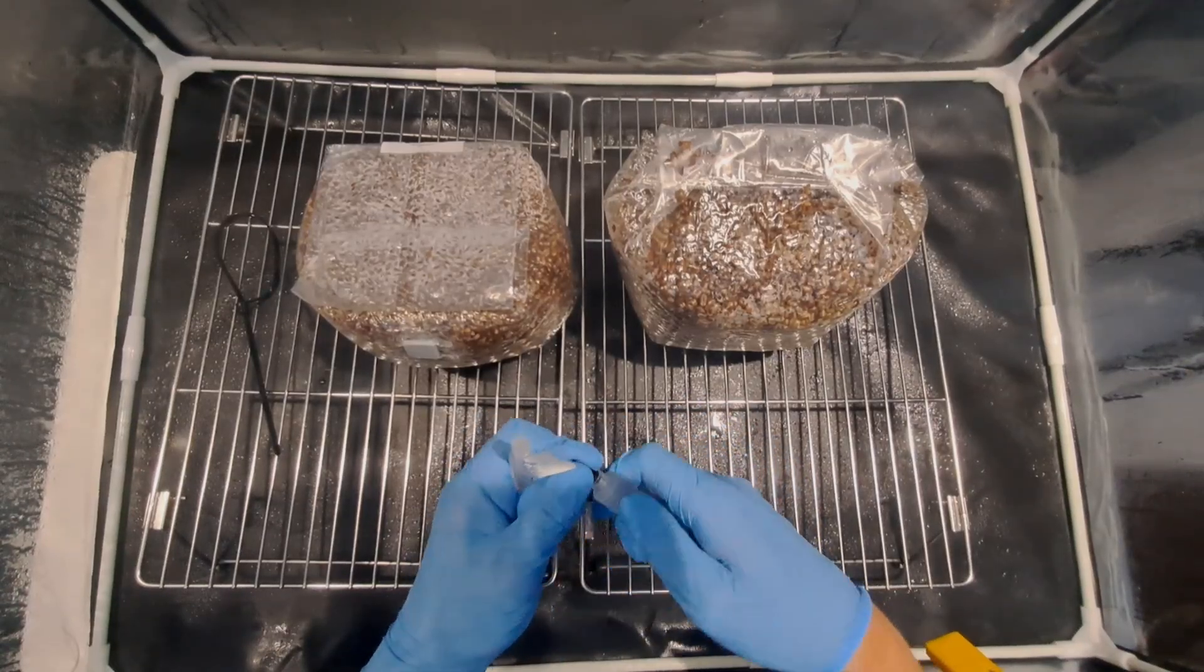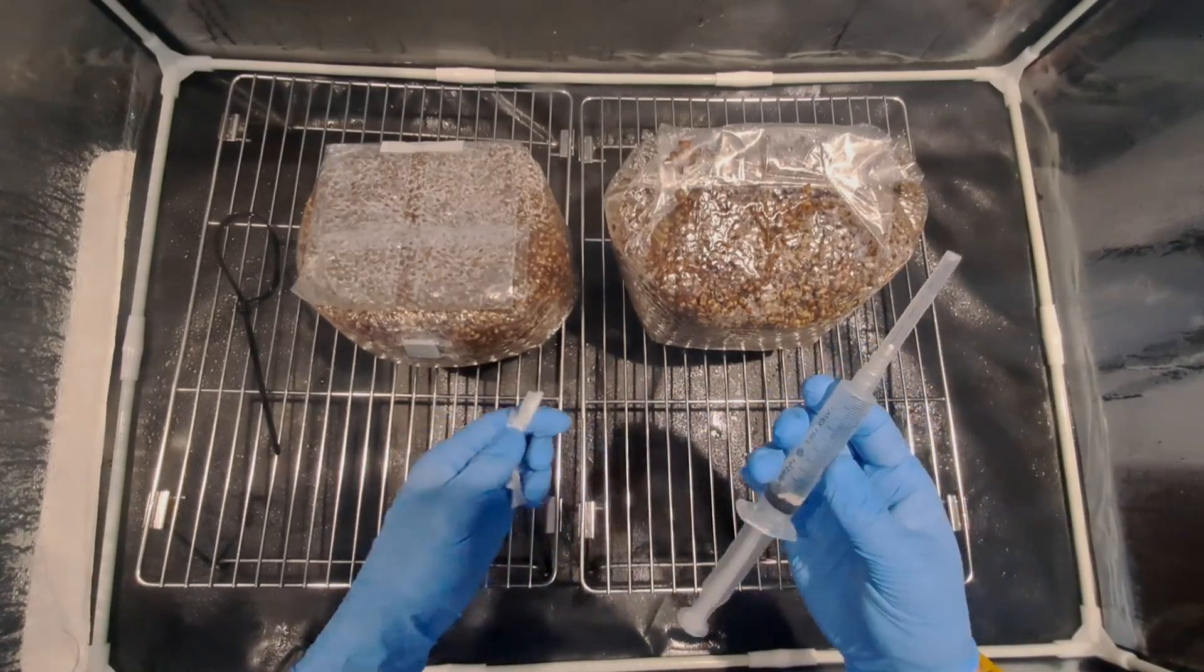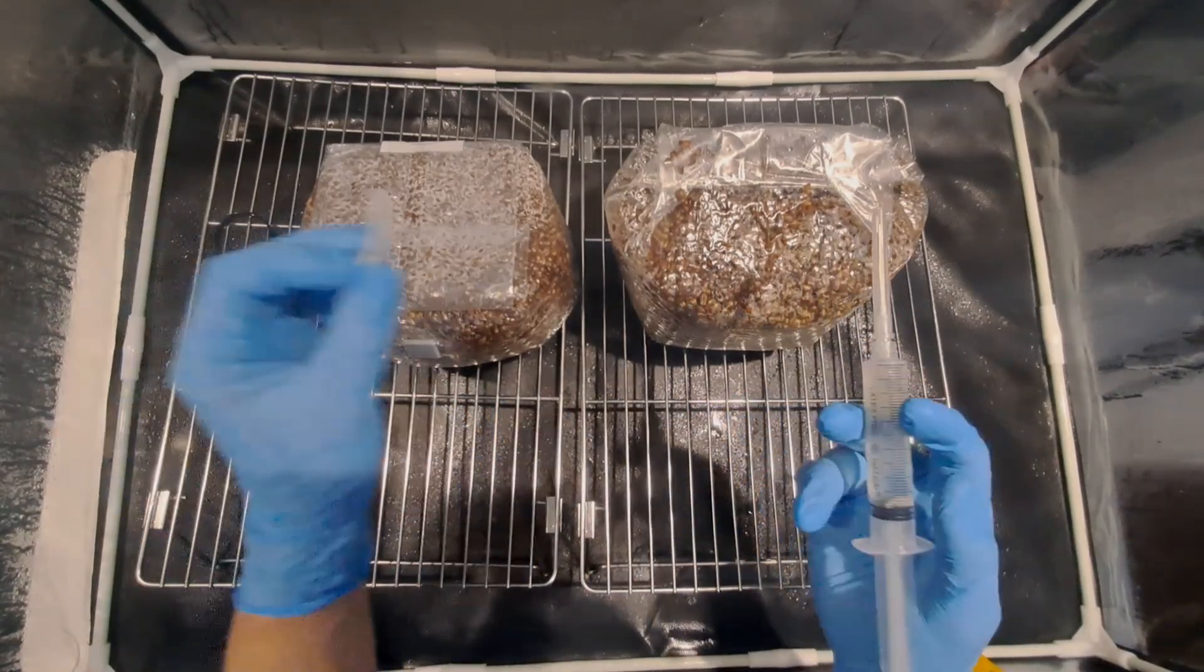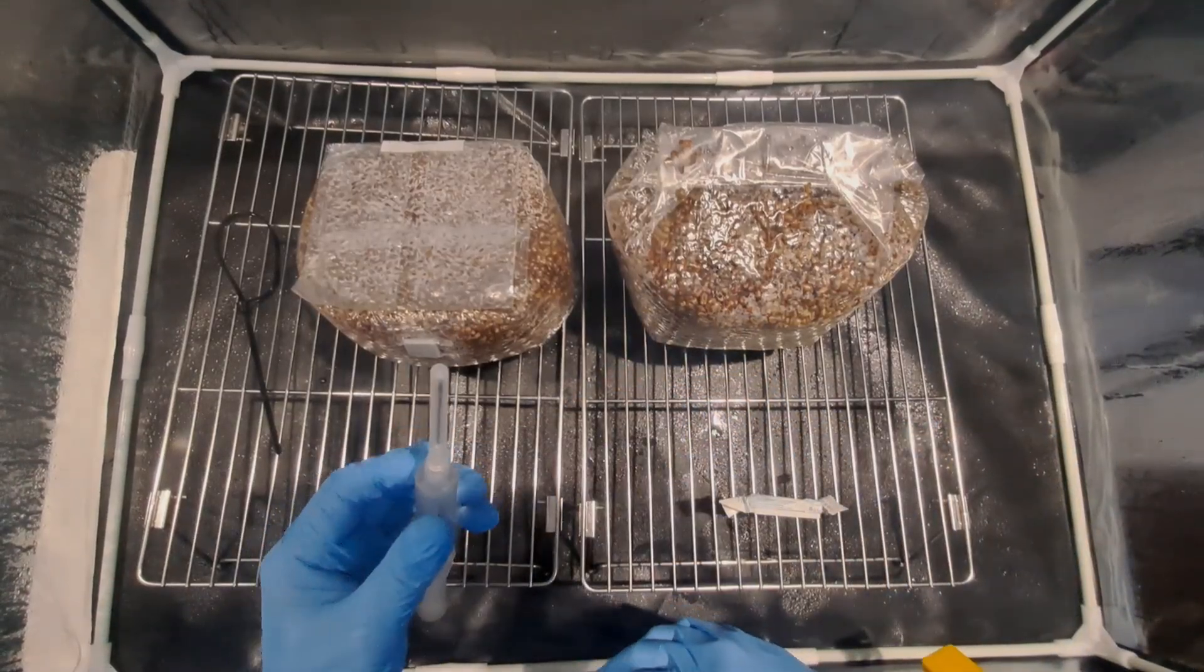When I'm ready to do the inoculation I quickly remove the luer lock, remove the needle from the sterile packaging and assemble the syringe. I then inoculate straight through the injection port into the center of the grain.